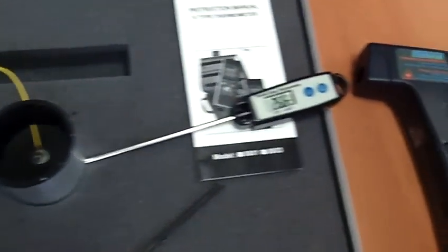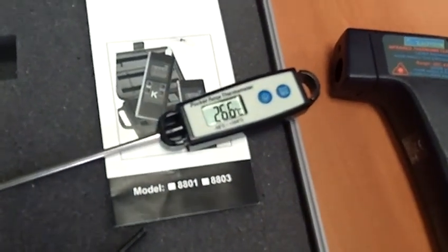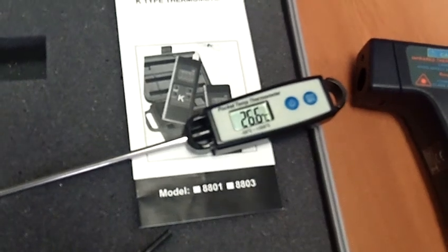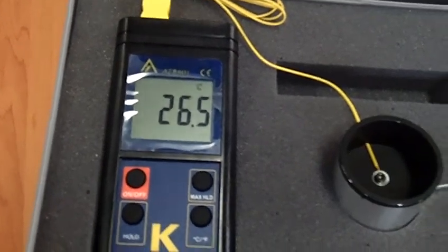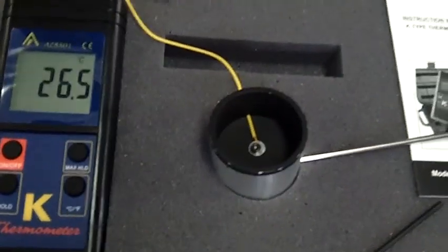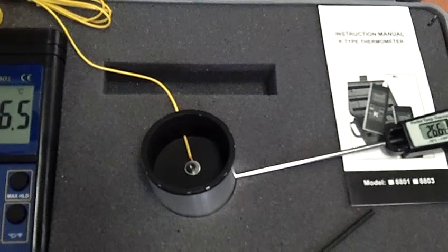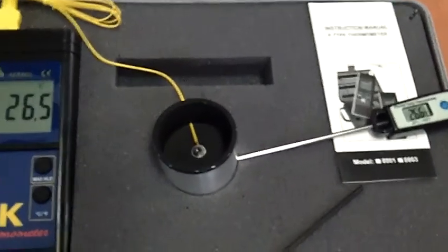Now if we look at the probe thermometer that's been put in, it has a reading of 26.6 against the master unit's calibration temperature of 26.5. It's within 0.1 of a degree, so it's very accurate and well within the standards. Both of those units have been calibrated.